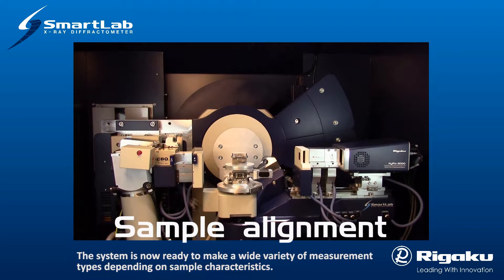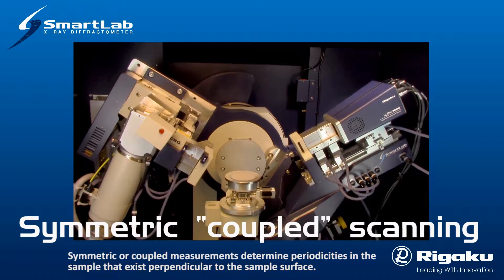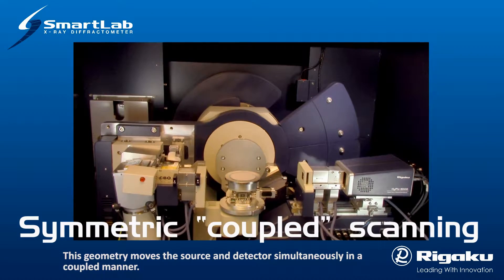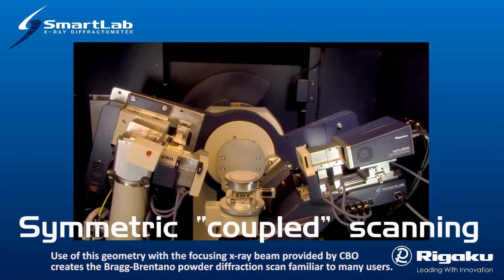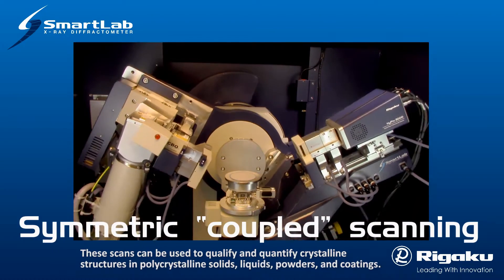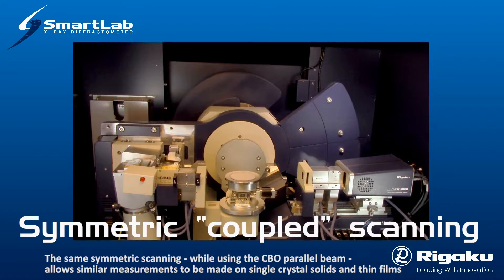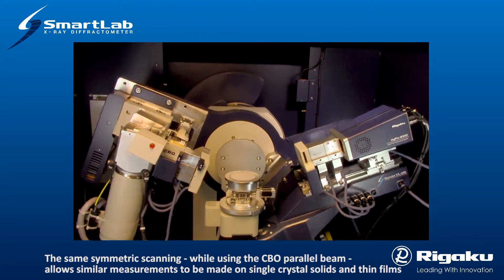The system is now ready to make a wide variety of measurement types depending on sample characteristics. Symmetric or coupled measurements determine the periodicities in the sample that exist perpendicular to the sample surface. This geometry moves the source and detector simultaneously in a coupled manner. Use of this geometry with the focusing X-ray beam provided by CBO creates the Bragg-Brentano powder diffraction scan. These scans can be used to qualify and quantify crystalline structures and polycrystalline solids, liquids, powders, and coatings. The same systematic scanning, while using the CBO parallel beam, allows similar measurements to be made on single crystal solids and thin films.